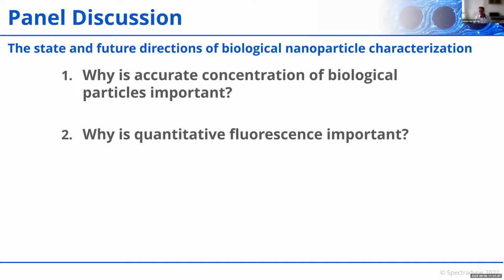Now, the shape of the fluorescence distribution of particles in biofluid could be interesting as well. So if you could quantify this shape, and again, due to the quantitative manner, you can start comparing it and reproduce its data. I think that's very interesting to investigate. Oh, cool.